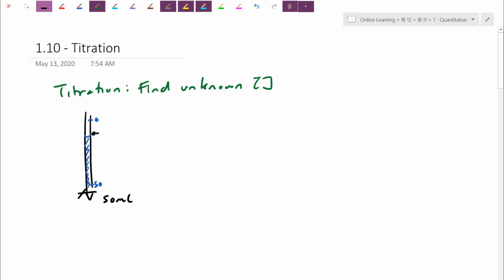We're going to have maybe this mark here. We're going to make a starting reading. Let's say this reading here starts off at 10. I'm just going to zoom in on what that part looks like. I'm going to see the 10. I can see a tick, tick, tick, tick, 5, tick, tick, tick, tick. I can see it like that. I can see like 11.